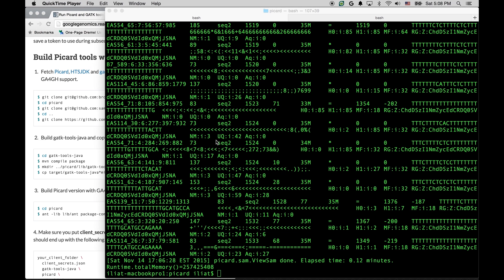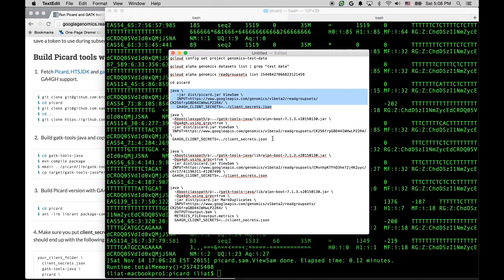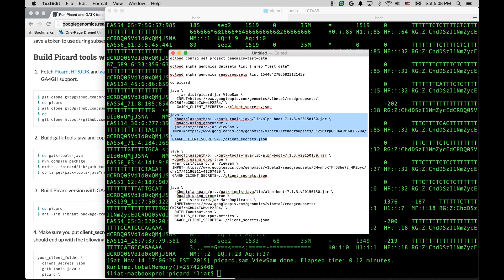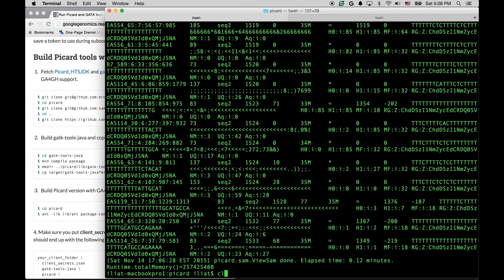We can also run a faster version of the API access that uses gRPC technology. It is more than 10 times faster. Here's the command line, and I'm going to explain it as well.